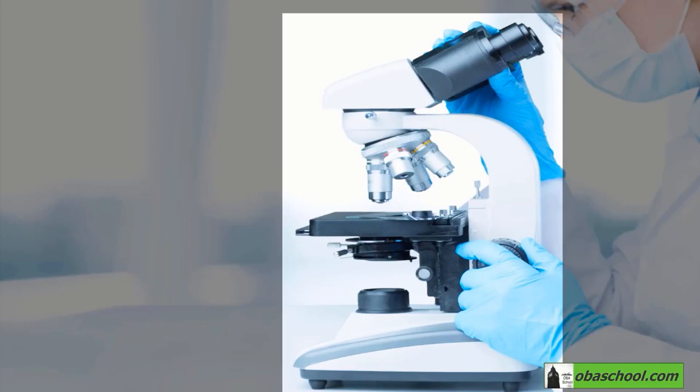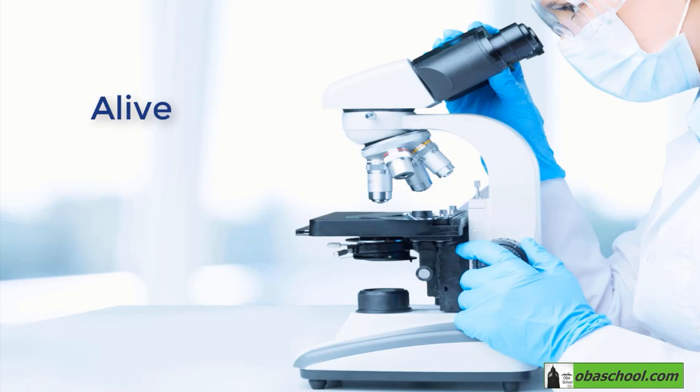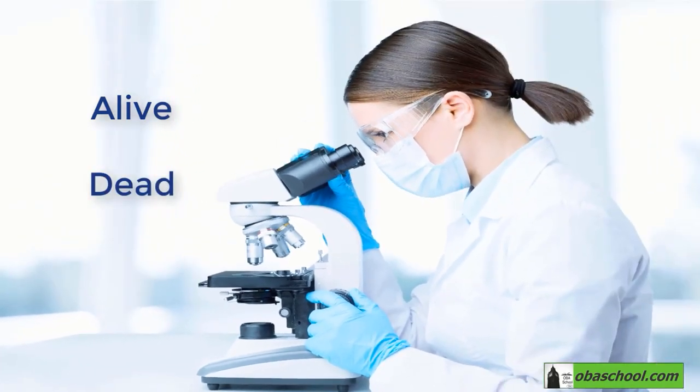A microscope is an instrument which enables us to view the characteristics of alive and dead specimens which cannot be seen by our naked eye.